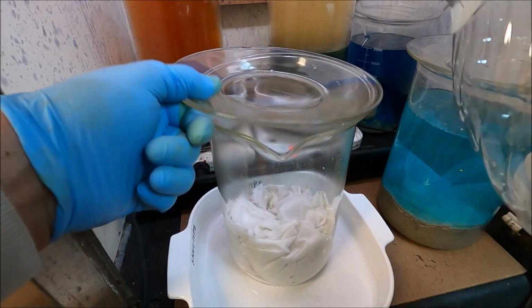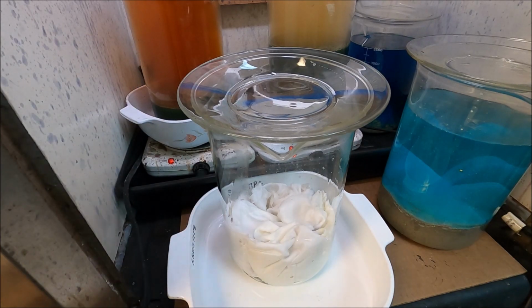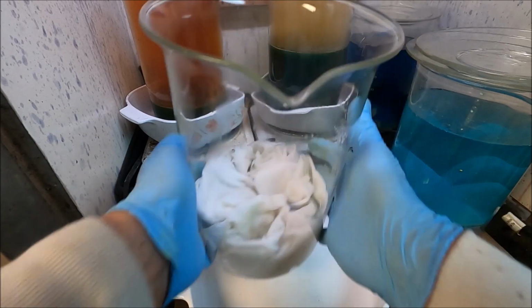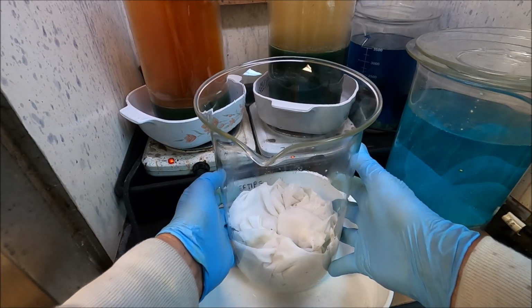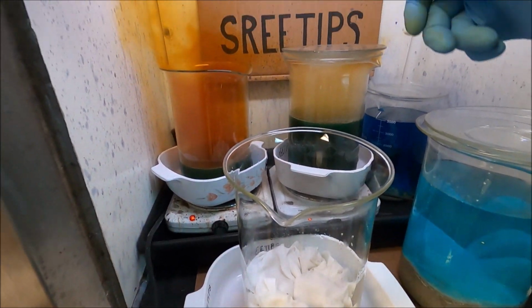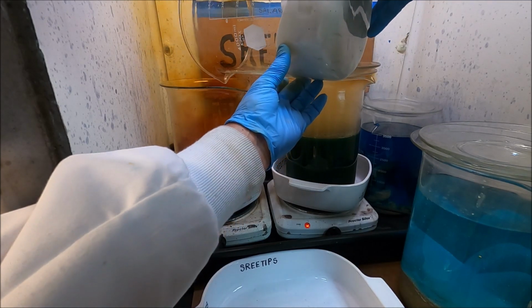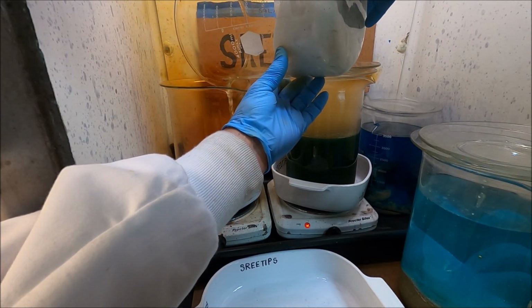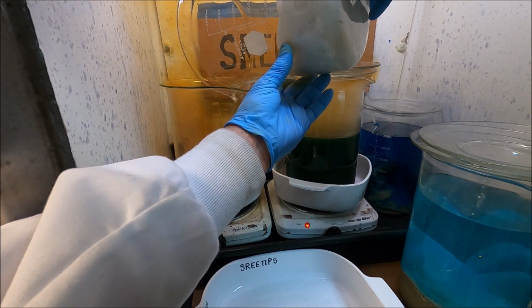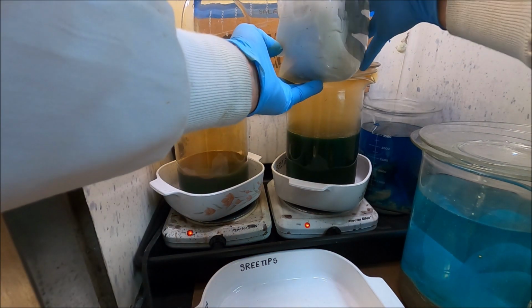I'm going to rinse these filters off with a little bit of distilled water, and then what we'll do is add that rinse to our beaker up here that we just stuck on the heat, so that we've got some water in this beaker so that the metals will have a place to dissolve into once we get everything going into solution in this finely divided material back here in the back.